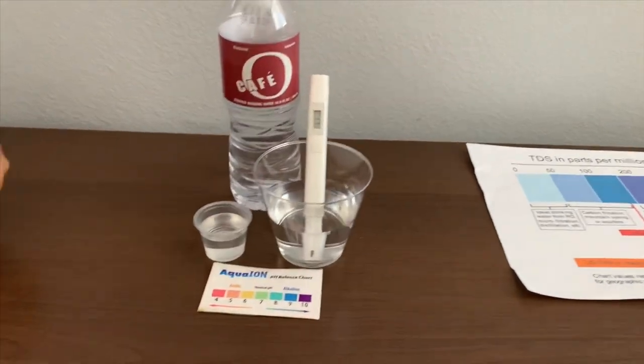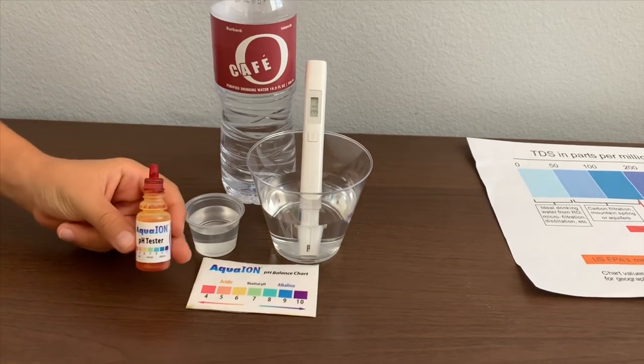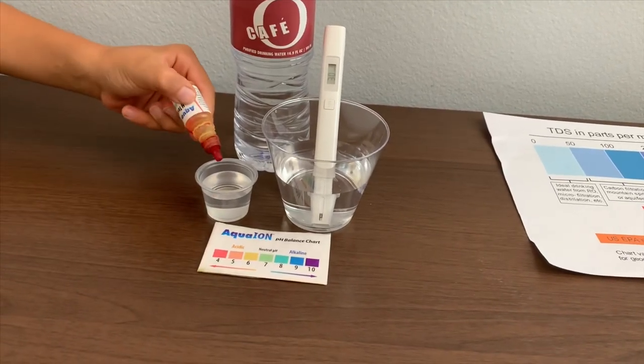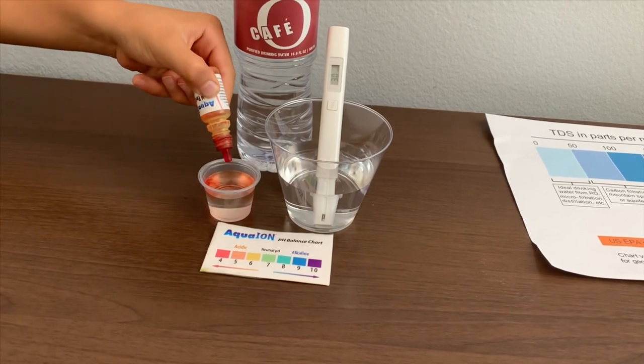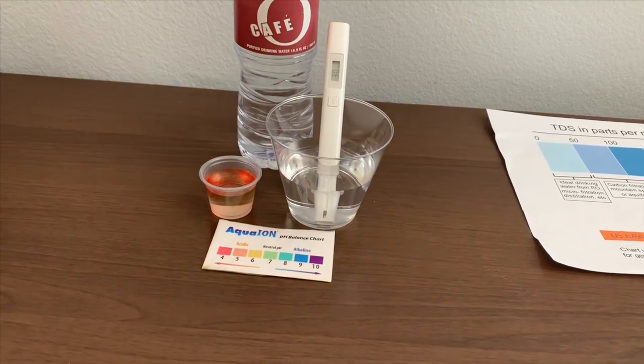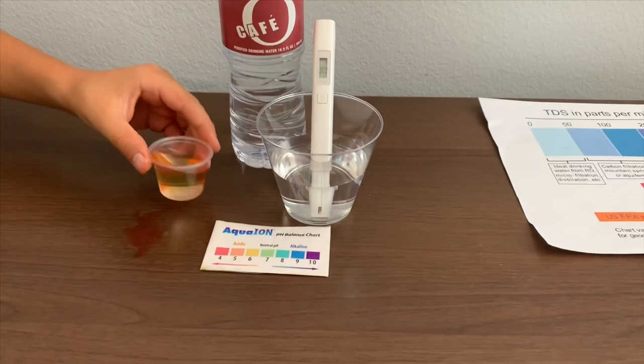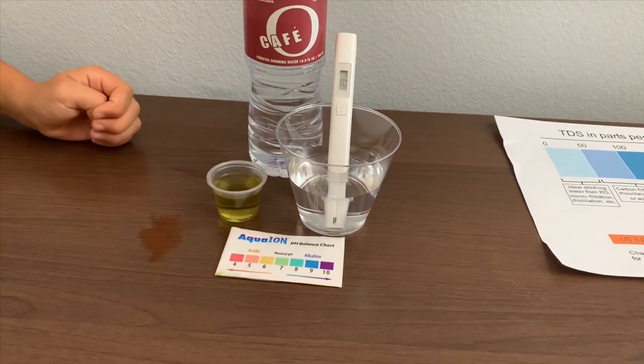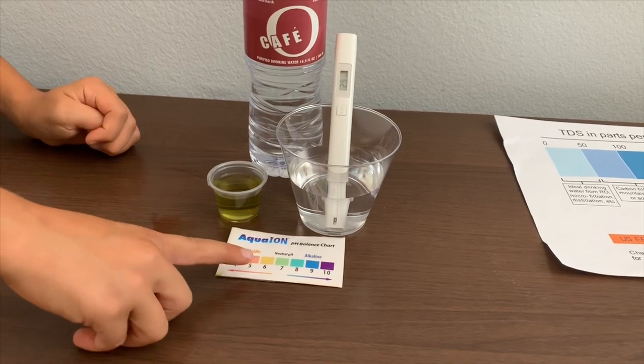Now let's test the pH level. If you want to buy this pH tester, check the link down below. Only do two drops. Let's stir it in a little for a better result. I give this a 7 — just a neutral pH.